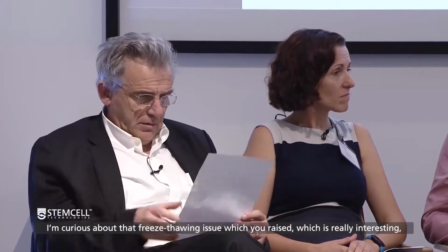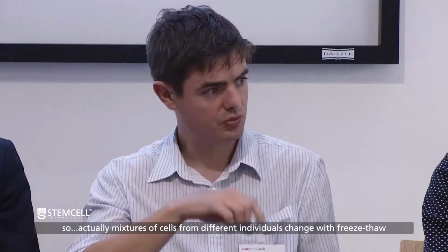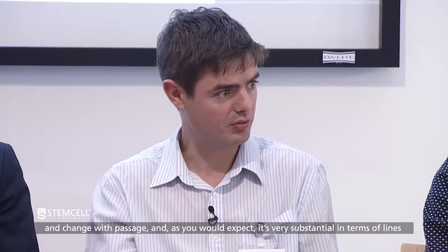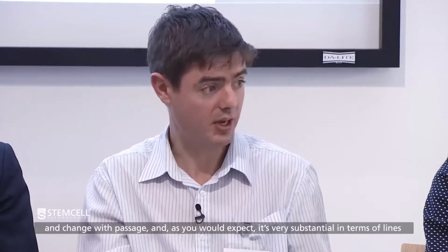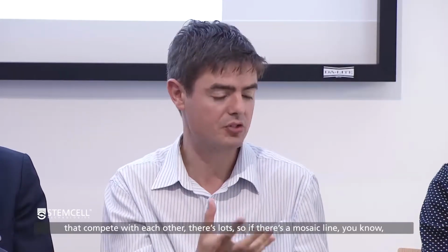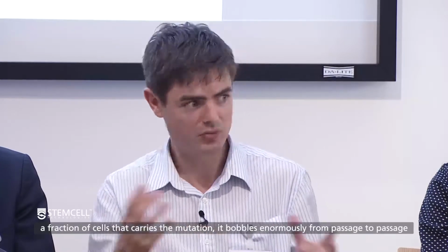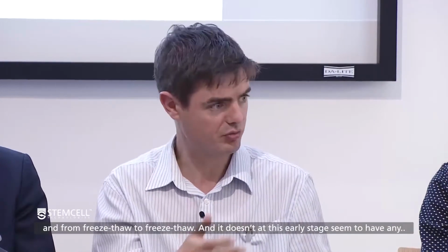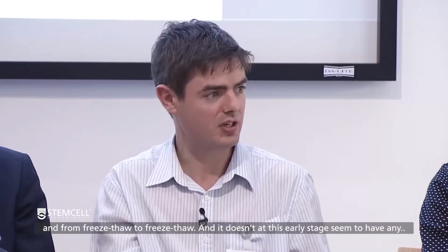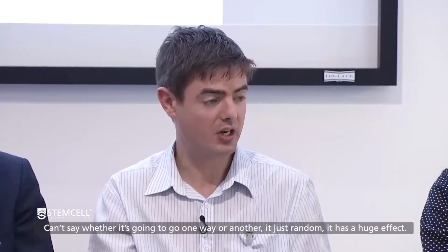The freeze-thawing issue, which you raised, is really interesting. I just wondered if any of you have actually looked at that at all. So actually, mixtures of cells from different individuals change with freeze-thaw and change with passage. As you would expect, it's very substantial in terms of lines that compete with each other. If there's a mosaic line, the fraction of cells carrying that mutation wobbles enormously from passage to passage and from freeze-thaw to freeze-thaw. And at this early stage, you can't say whether it's going to go one way or another. It's just random, but it has a huge effect.